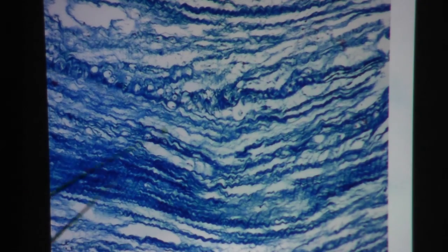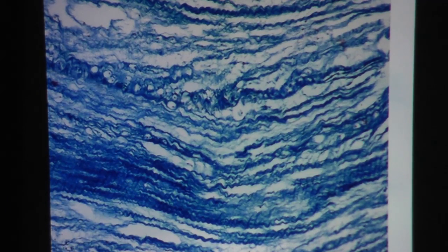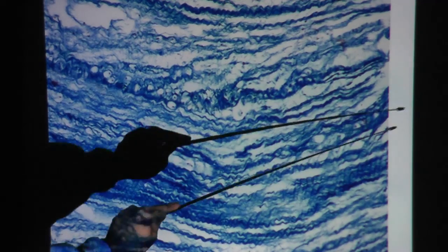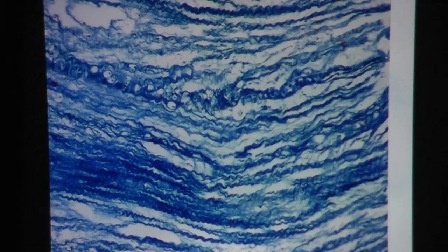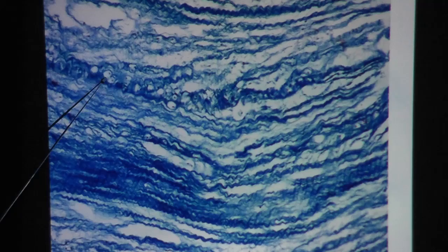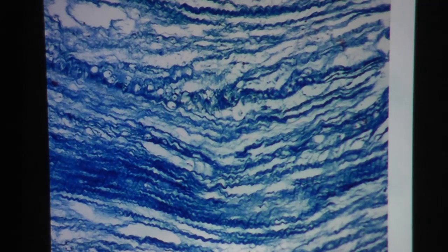Another view of the wavy collagen fiber — that should jump out at you. When you see those long strands of collagen fiber, you should think of something that has a lot of collagen, which could be dense regular or fibrocartilage. If you can also see chondrocytes in lacuna, that would help you determine that this is fibrocartilage.